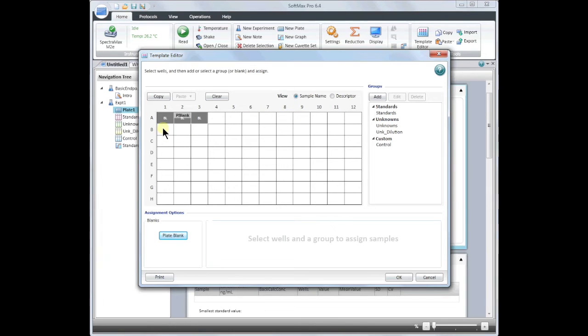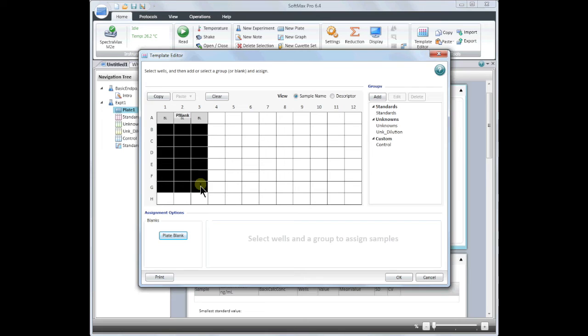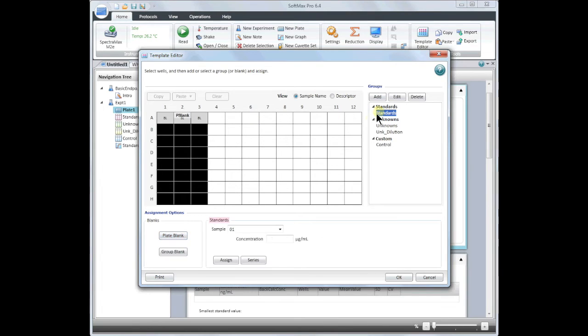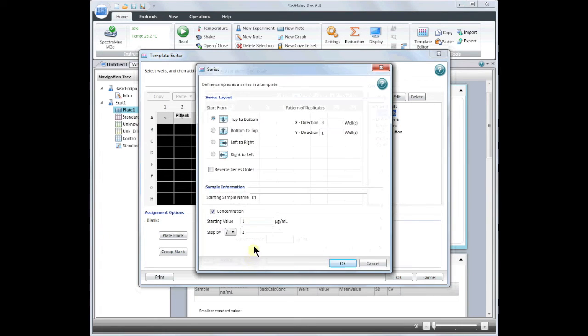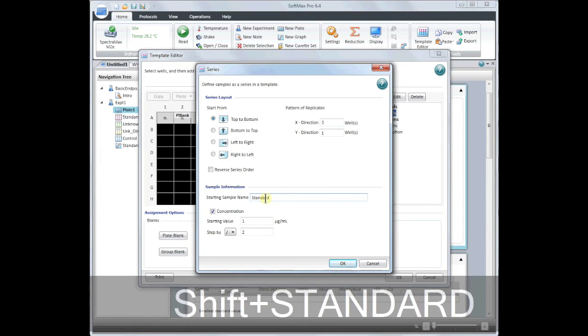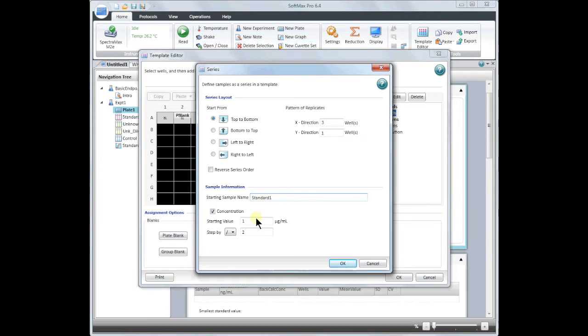Next, I will set up my standards. You may do this one by one or you can edit in bulk as a series. Highlight the wells you wish to use for your standards and then click on standards. Next you will want to click on series. Here you can make changes to the sample name as well as set the step of the concentration.